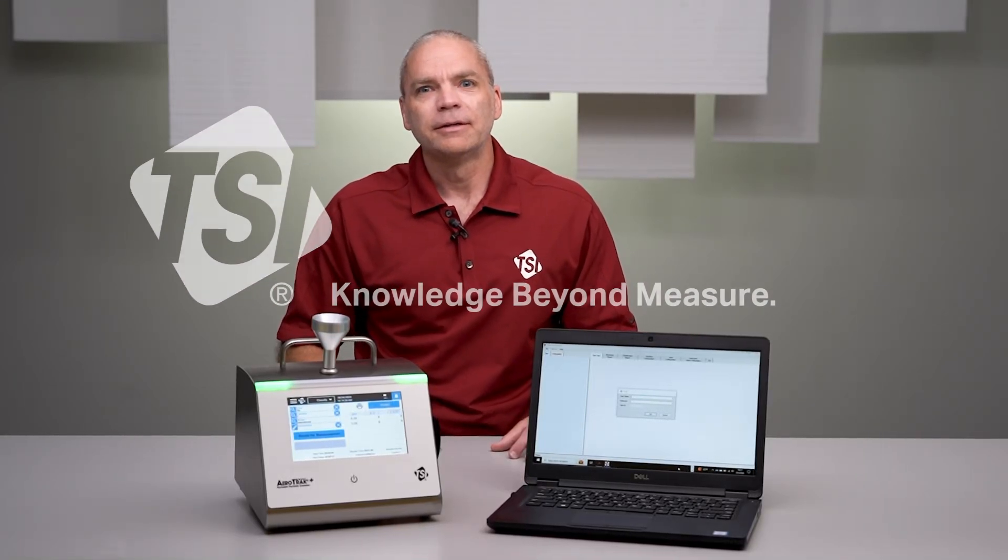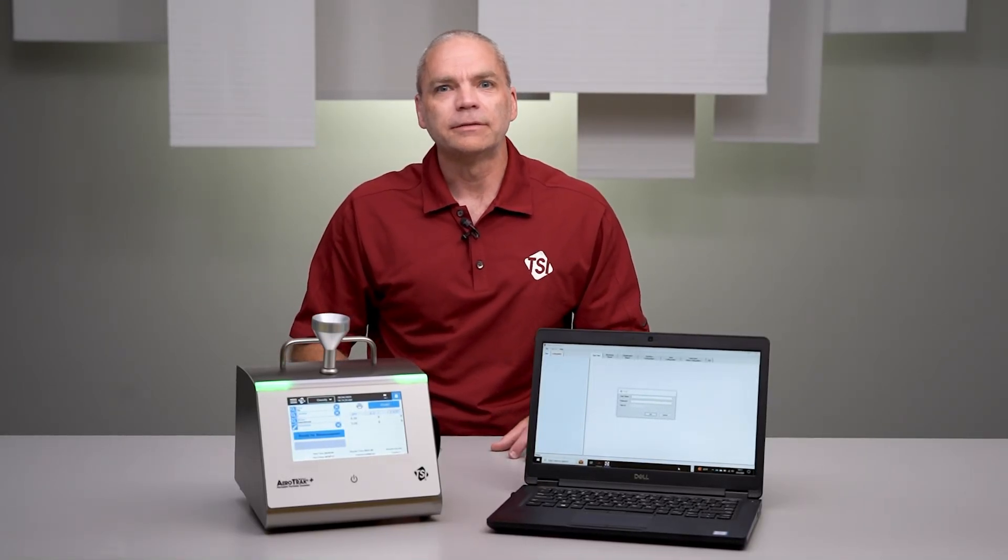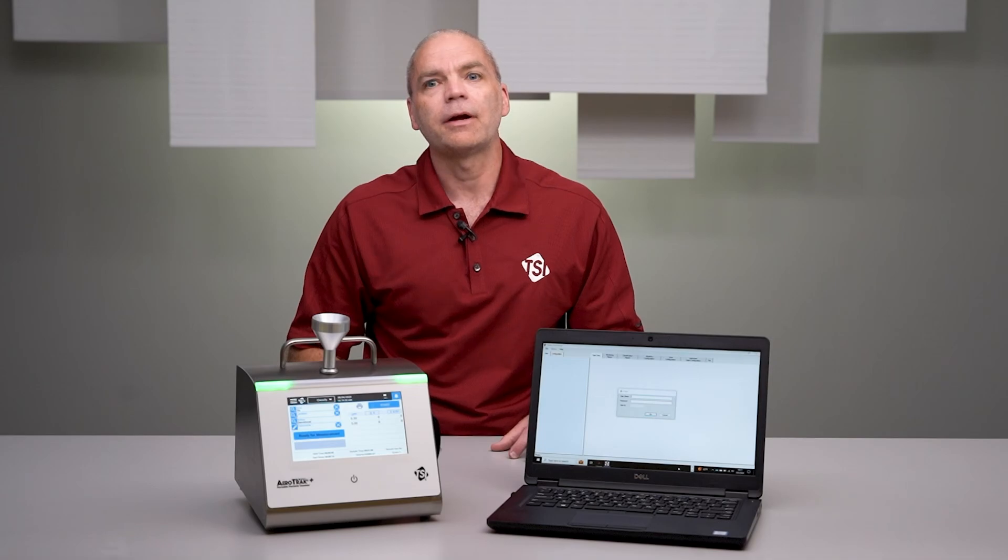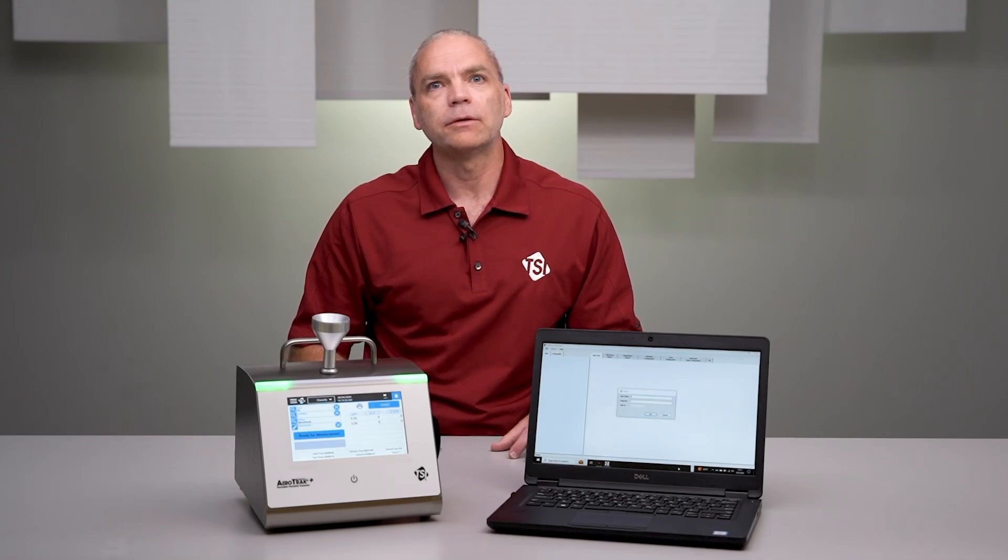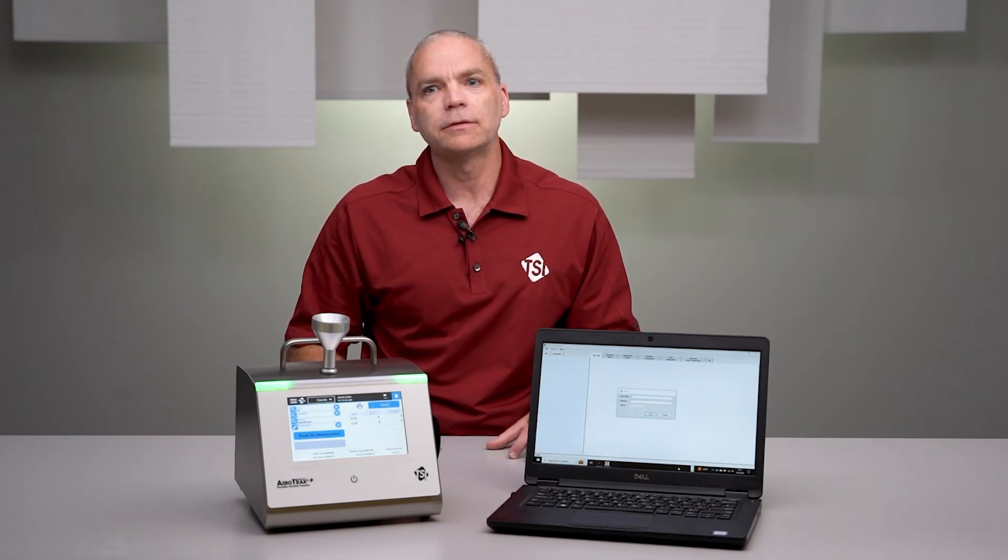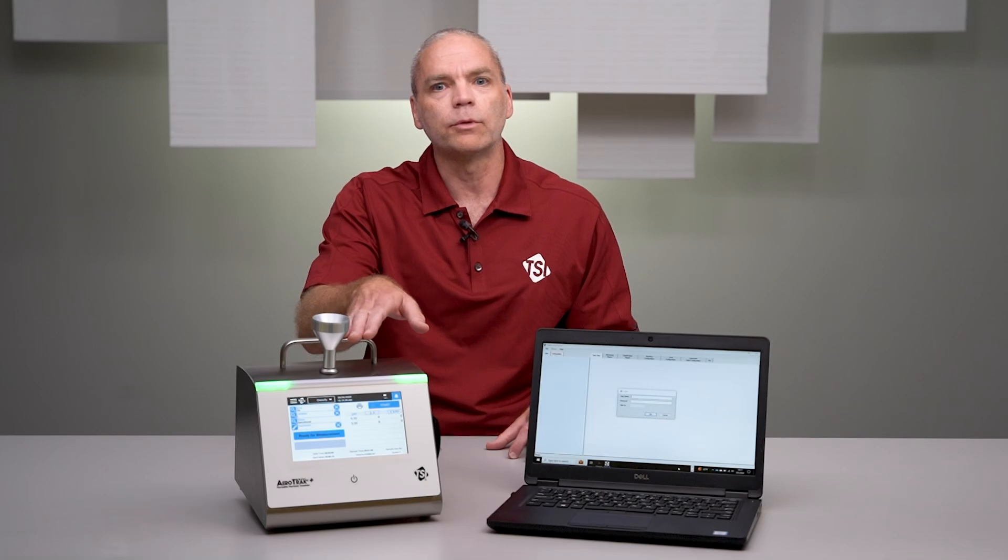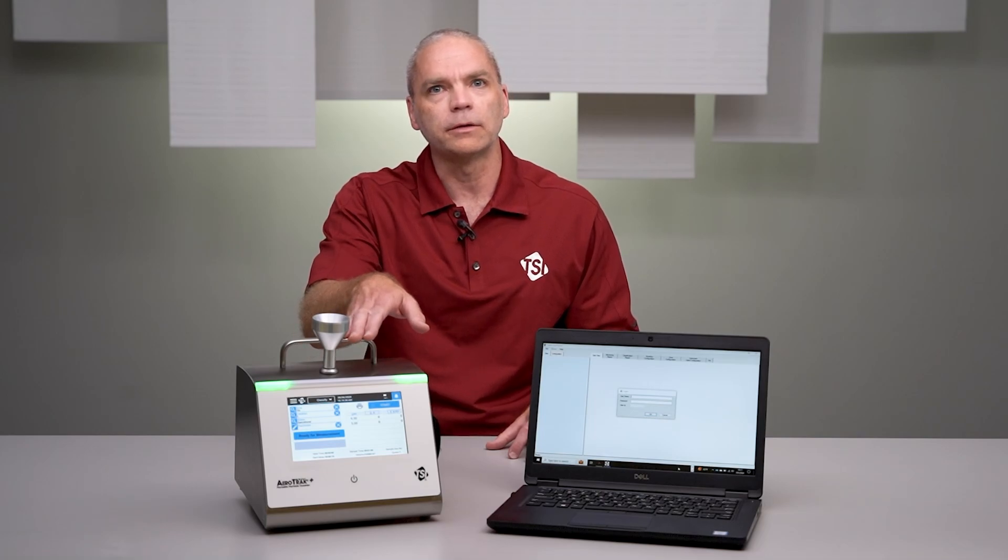Hi, this is Mike Dingle, and today we'll be discussing TrackPro Lite Secure software. TrackPro Lite Secure, or TPLS, is software that works with the Aerotrack Plus A100 portable particle counter.